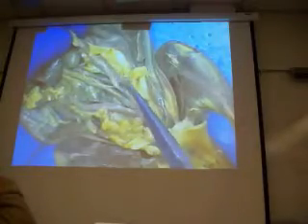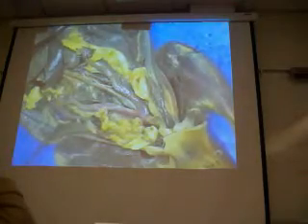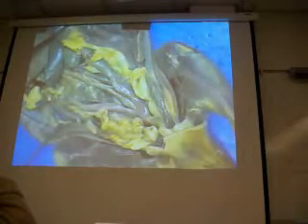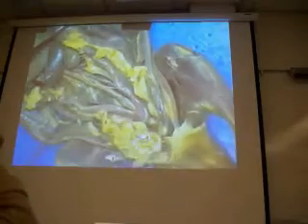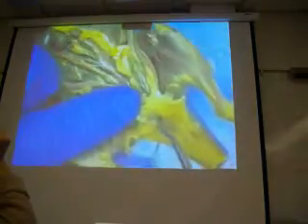So embedded in all this stuff is the ovary and the fallopian tubes. And then starting right here, this is one of the uterine horns. Like in the shark, that was one of the uterine horns. It was a portion of the uterus. Whereas if you look at the human, we don't have these big long horns coming up. Those are the fallopian tubes that come up. And so the main body of the uterus is right here. This is a uterine horn. This is another uterine horn over here. And then that'll lead out into the vagina right over here.